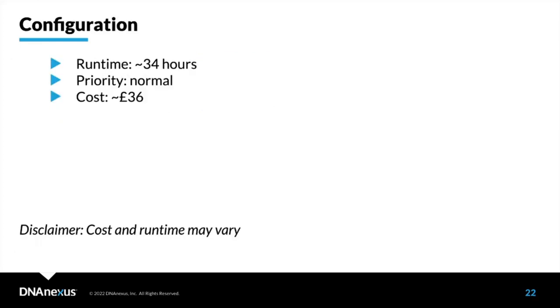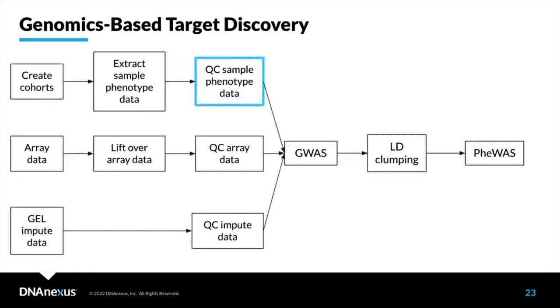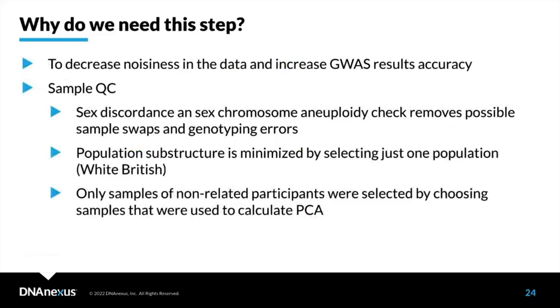Now we have all data prepared for the QC step. We'll do sample QC first, though the order doesn't matter. We need sample QC to remove possible sample swaps and genotyping errors, and to minimize the effect of population substructure.